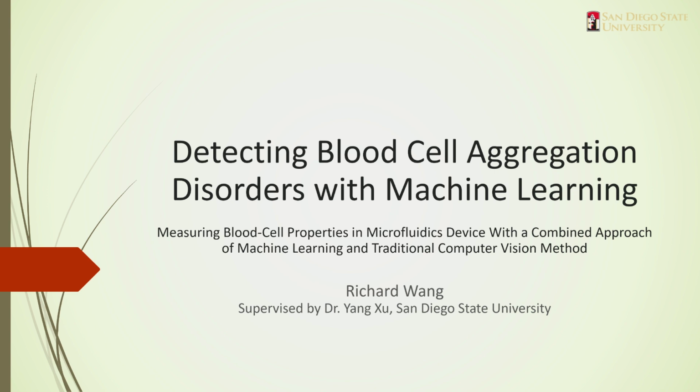Today I will be presenting my project, Detecting Blood Cell Aggregation Disorders with Machine Learning, measuring blood cell properties in a microfluidics device with a combined approach of machine learning and traditional computer vision methods. I am grateful for Dr. Yang Xu of San Diego State University, who supervised me in this project.